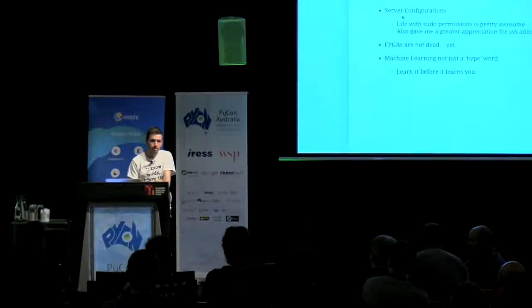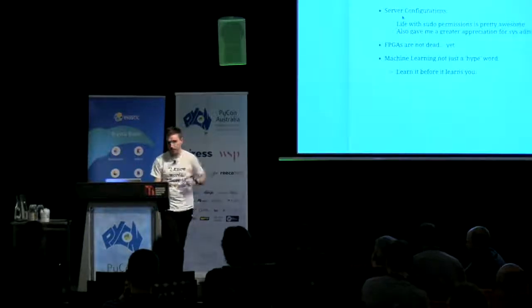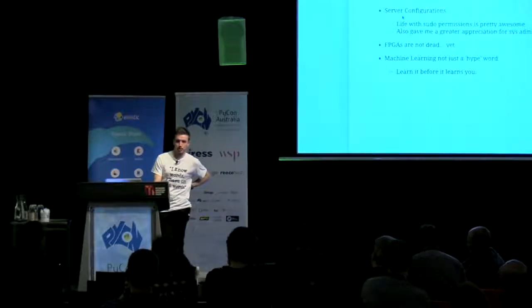You've then got an algorithm later on that takes those sequences and converts it into like that jigsaw thing. What does that algorithm look like generally? There's quite a few of those. It's not something that I tried on here, but it's definitely possible. People have really optimized those in the past few years to get them to be really quick.